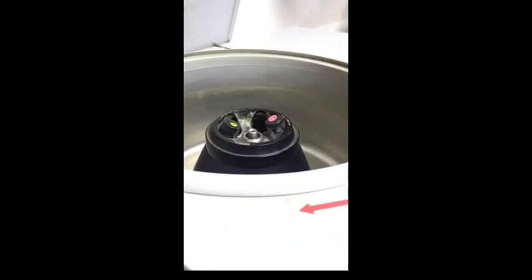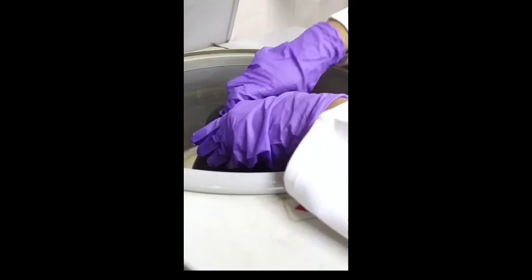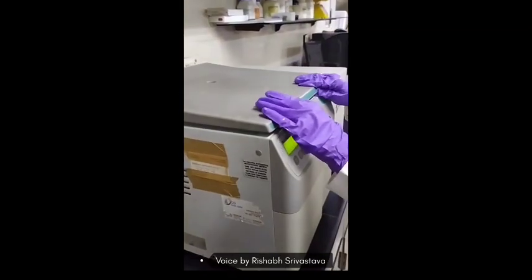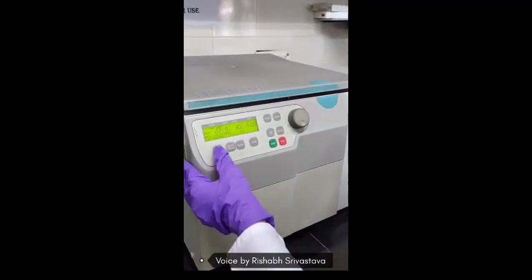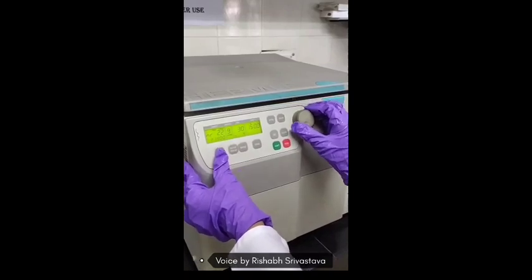Counter balance it by putting a blank opposite to the sample. Close the lid of the centrifuge machine. The machine has to be operated at 1500 rpm for 10 minutes and temperature should be around 4 degrees Celsius.